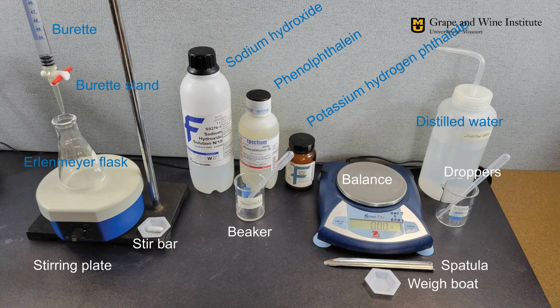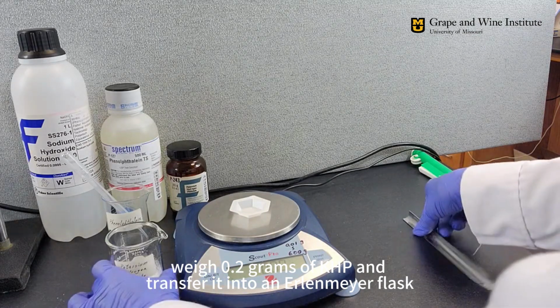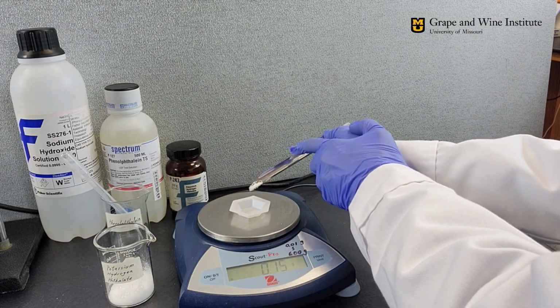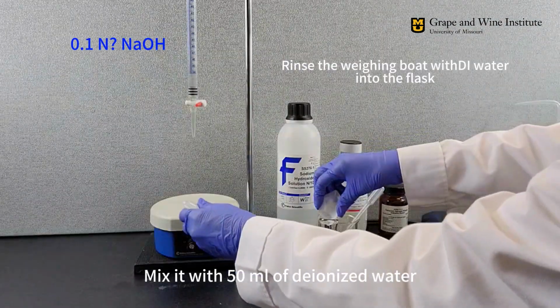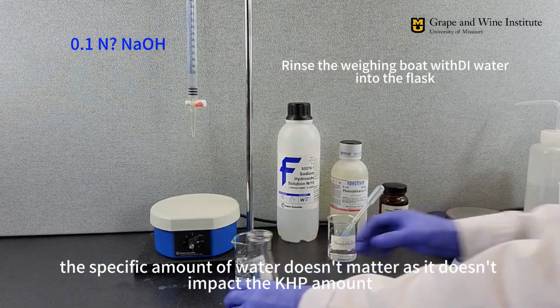Here is the material used and the 3 chemicals: sodium hydroxide solution, phenolphthalein solution, and KHP. First, weigh 0.2 grams of KHP and transfer it into an Erlenmeyer flask. Mix it with 50 milliliters of deionized water. The specific amount of water doesn't matter as it doesn't impact the KHP amount.